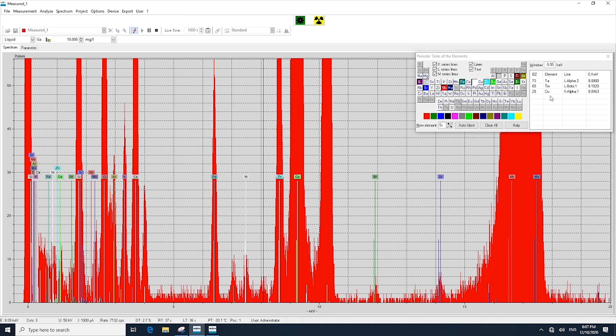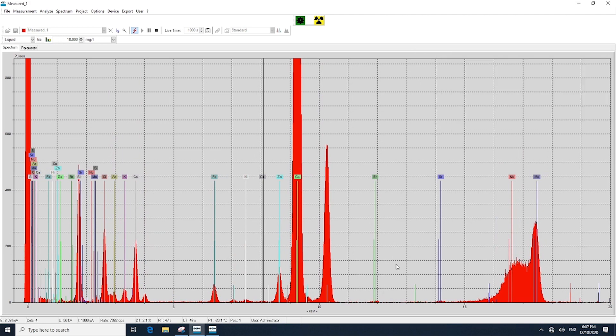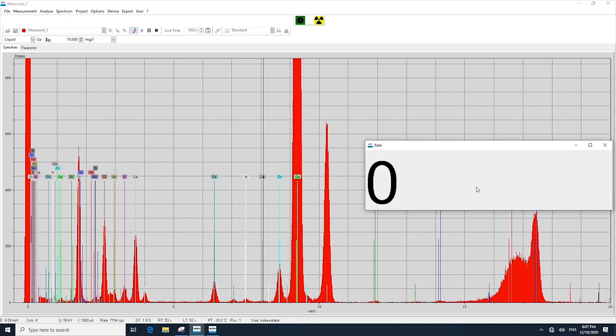The large peak in the middle is gallium — that is the internal standard we added to the sample, and if you remember, we added that at 10 ppm. Once the analysis is complete, we can then do our evaluation to understand the results present in the sample.